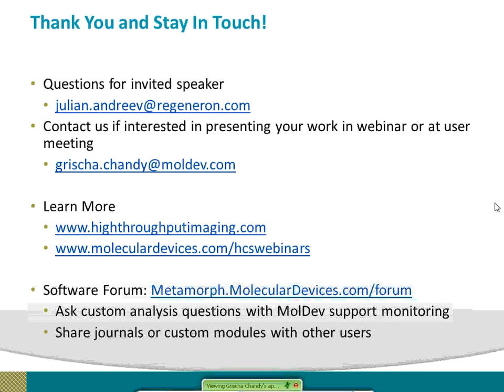I think he means, can you actually image the EPIC plate on any microscope? Yeah. You can take an EPIC plate and image it. We did that. I hope that answers the question. You can definitely take an EPIC plate and image it on an ImageXpress Micro, and then you can compare your EPIC results, at least the final point of measurement, with whatever imaging results you're going to have.